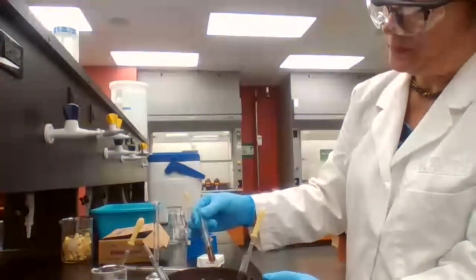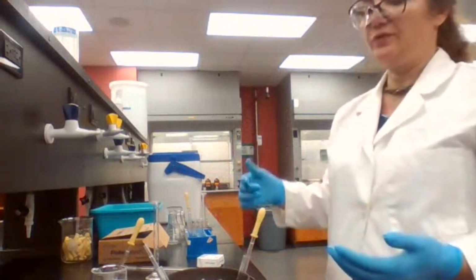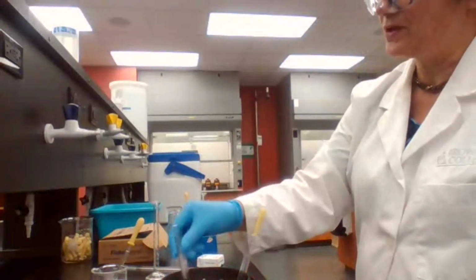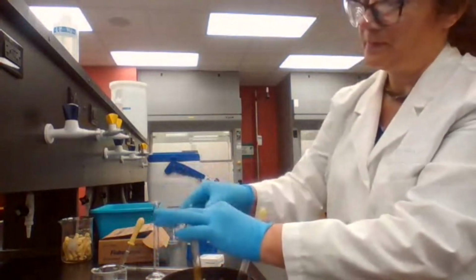But to follow the procedure, you have to leave this to go to room temperature. We wait for 15 minutes. And then we are going to see if it's actually working or not.